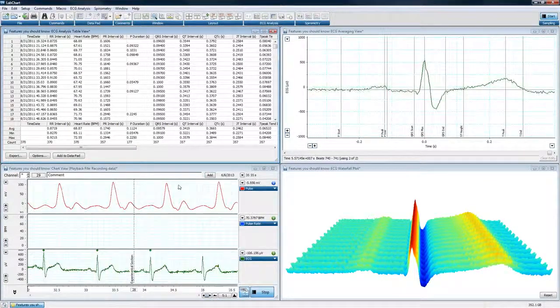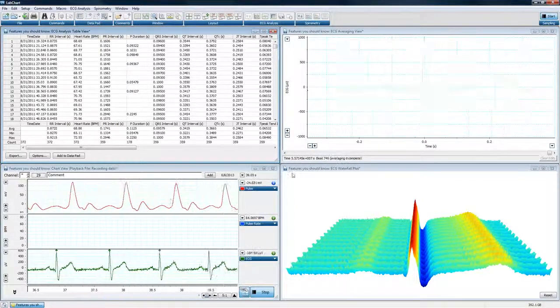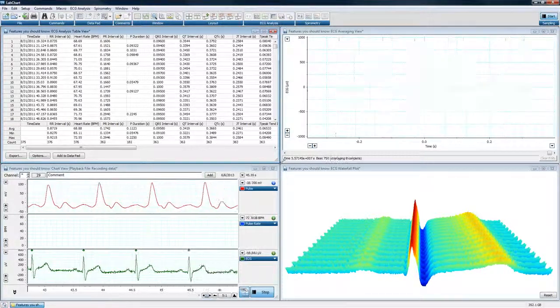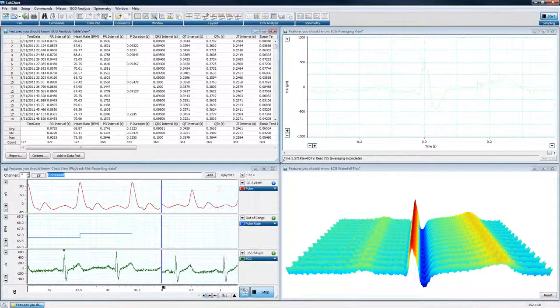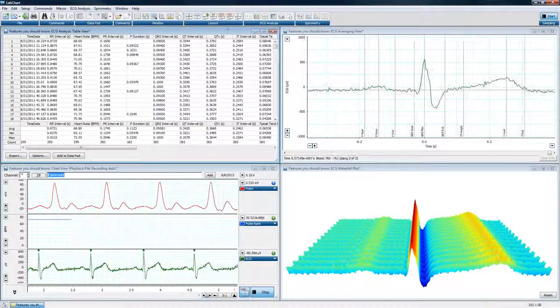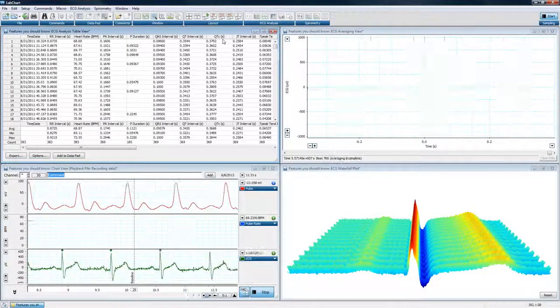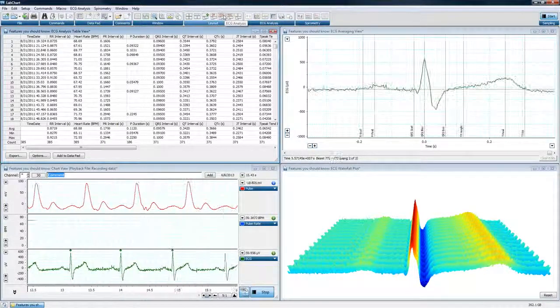Okay, so that's how layouts work, both Tile and Smart Tile, and those are things that people don't use a lot. When these features came out, I remember I was here when they came out. It was a simple frustration. One of the frustrations I had when using Windows and using the modules where you have multiple windows is the ability to really organize things, and we've really taken that and made it a really easy thing to do if you know how to use the layouts feature.